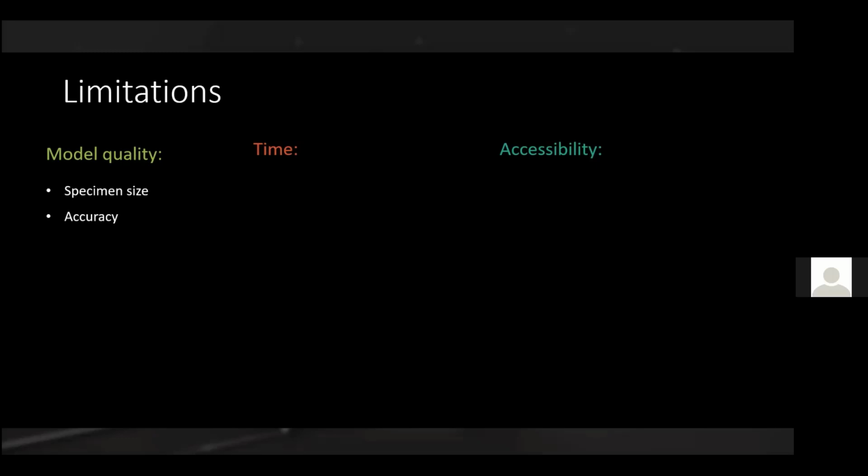Now, that applies if the structures are relatively bulky and this is a height difference that we can resolve. Whether we would necessarily say that we can reconstruct every single 10 micron structure is a different question, because it also depends on the number of pixels that belong to these structures. So it's relatively difficult to give a good number on accuracy for these models. We're still thinking about how we could best do this, because of course it's important, but the best thing that we could come up with in terms of the publication that we put out was this reconstruction of these gauge blocks.